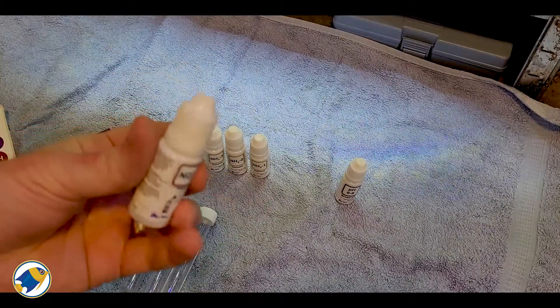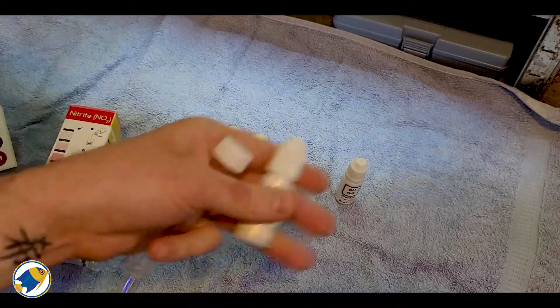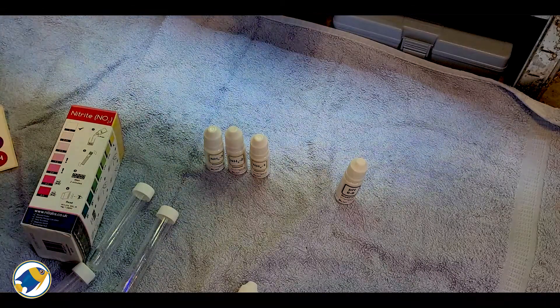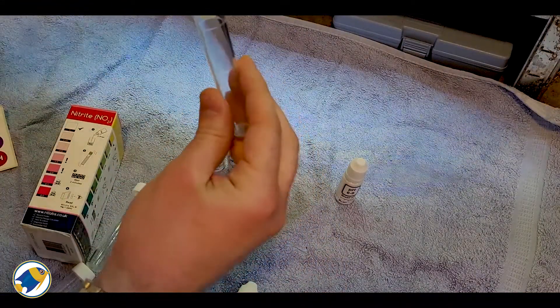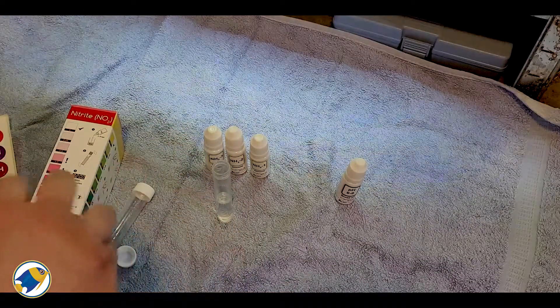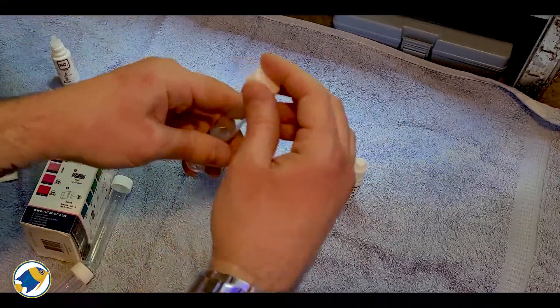We're going to try nitrite first. What you do is get 5ml of water and put it in the test tube, then do five drops of the solution, give it a good shake, and then wait two minutes and read the results. I'm going to be using one of these like calpol syringes because I always find they're a lifesaver if you've got kids. The first thing I find a bit of a pain is that you have to take water out of your aquarium to put in a test tube, whereas with test strips you're just dipping it into the water itself.